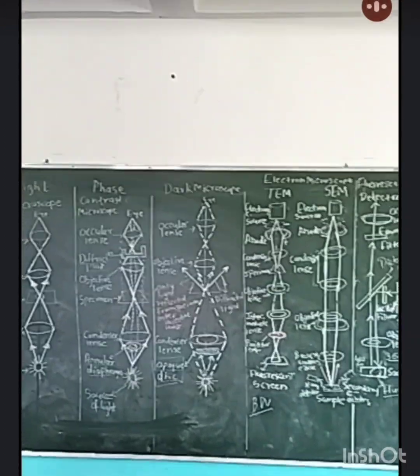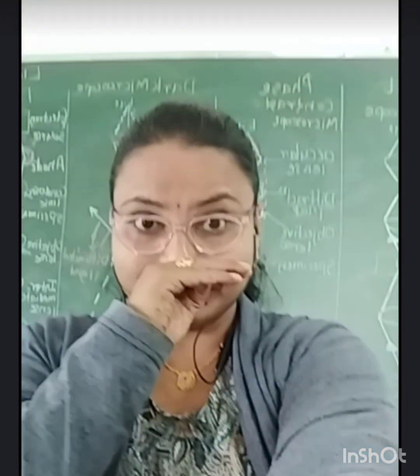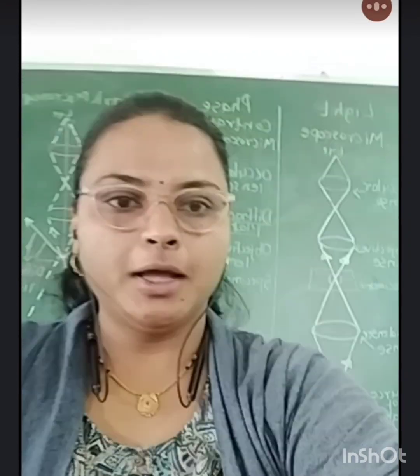Okay, have you understood? Okay, so this is the revision of the different types of microscopes.